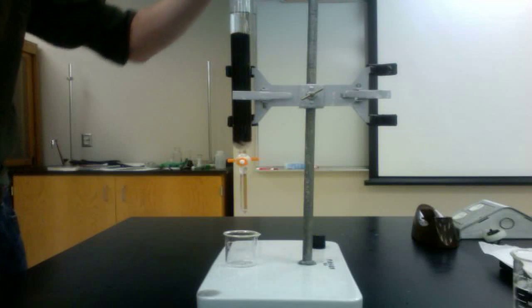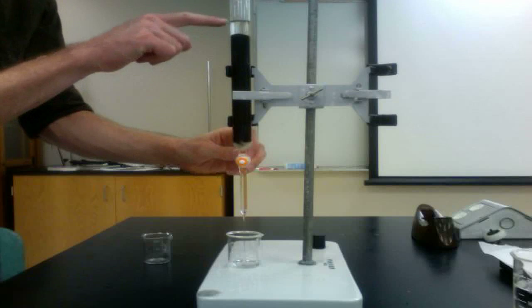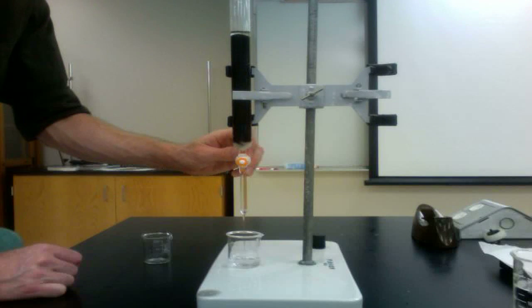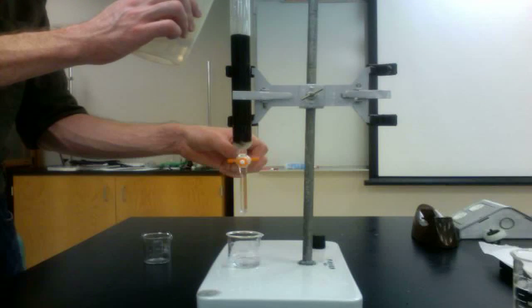Once all the solution has been added to the column, open the stopcock and collect the effluent in a beaker or flask. Keep all the liquid that is collected from this point on. Once the water level in the column reaches the height of the resin, add some pure water to continue to flush the salt solution through the column.